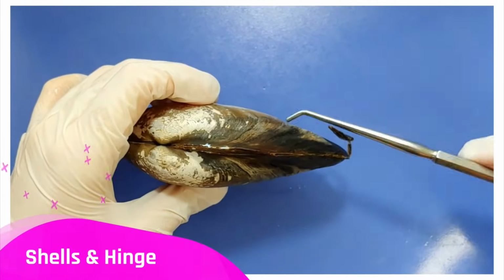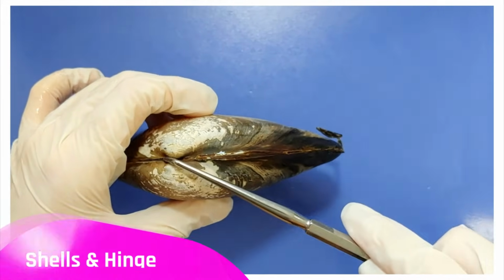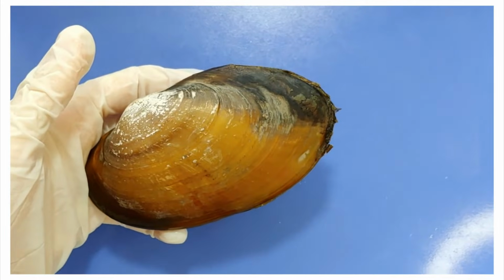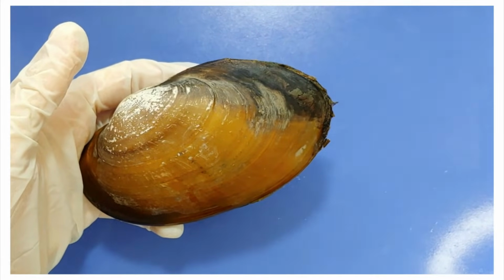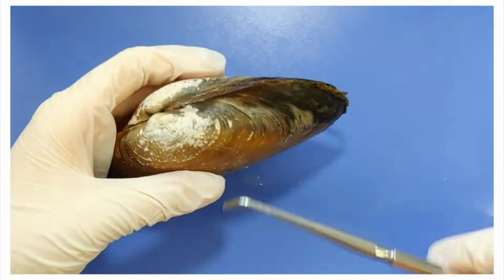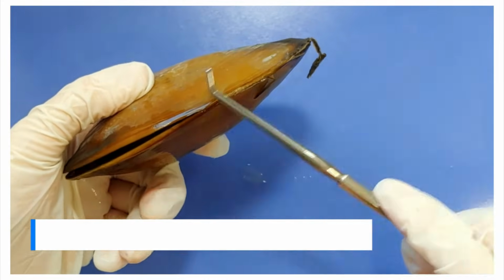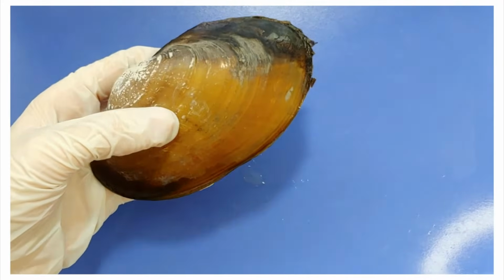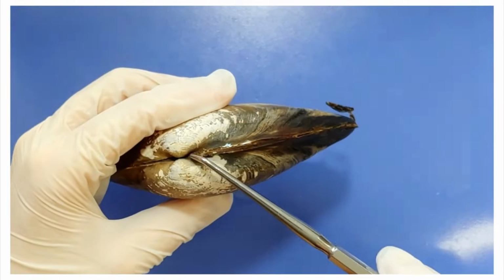These are the two shells, and a hinge connects them here. Now, it may be difficult for you to tell which way is up with these things, because they refuse to be constrained by our standards of cephalization. The hinge area is actually the top or the dorsal side, while the opening is the bottom or the ventral side.